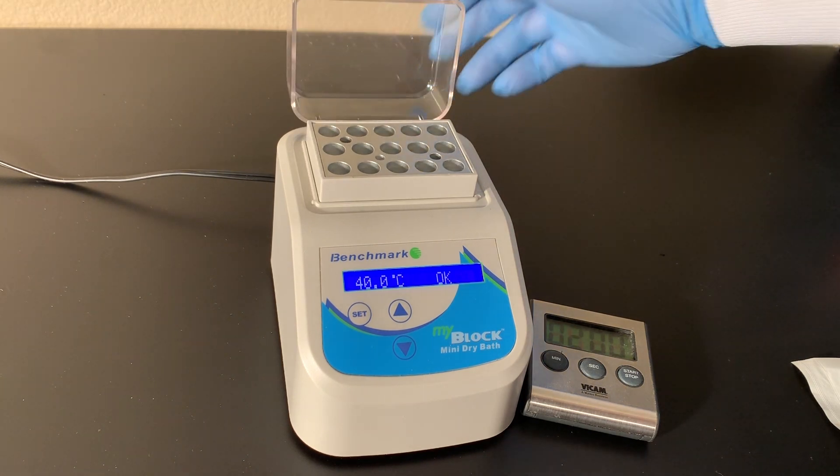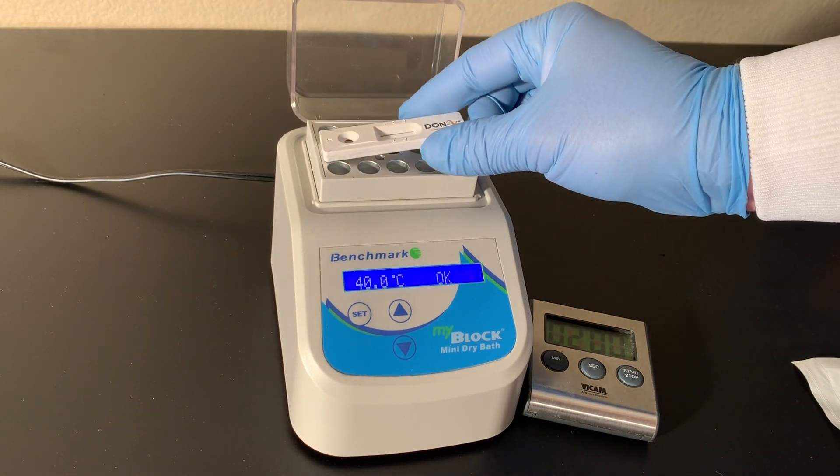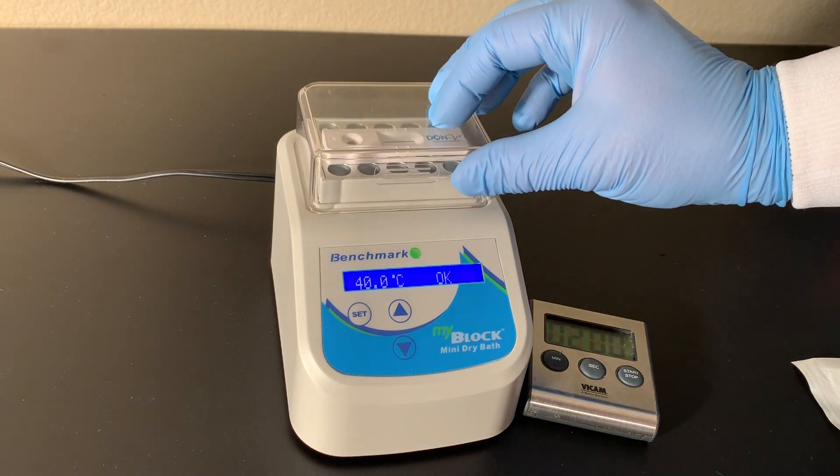If you're using the DON V test for deoxynivalenol, pre-incubate the DON V strip for 2–10 minutes while you prepare the sample.